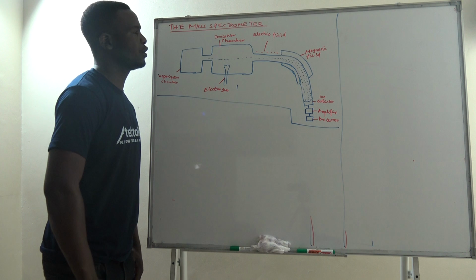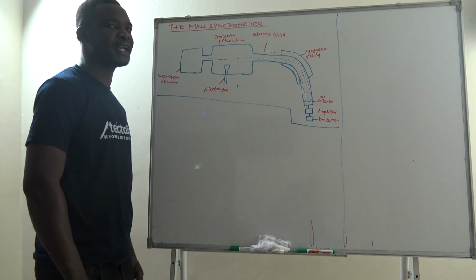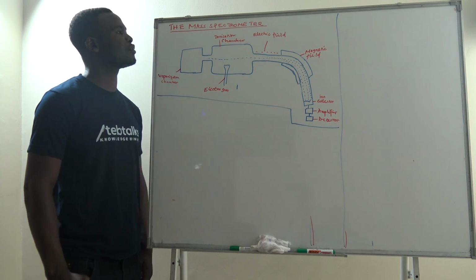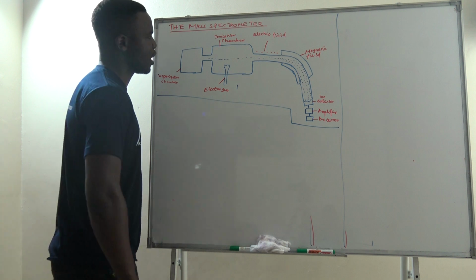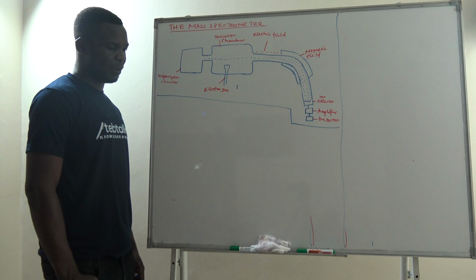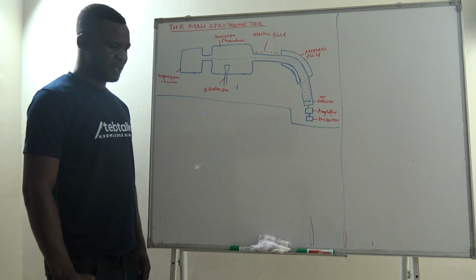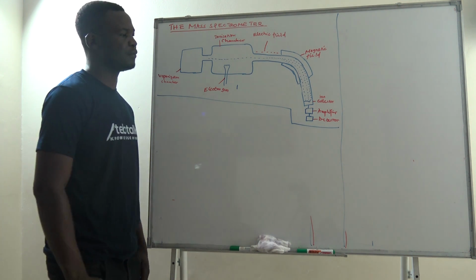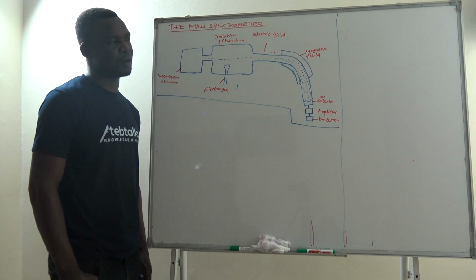In today's lesson, we're going to look at an instrument that is very useful in chemistry, and this instrument is called a mass spectrometer. We have a sketch diagram of the mass spectrometer on the chalkboard. Now, what is the use of a mass spectrometer? A mass spectrometer is an instrument that is used to determine the relative atomic mass of elements or compounds.